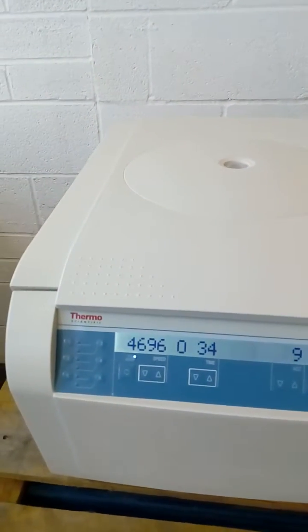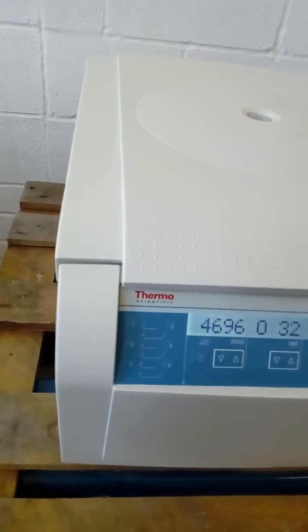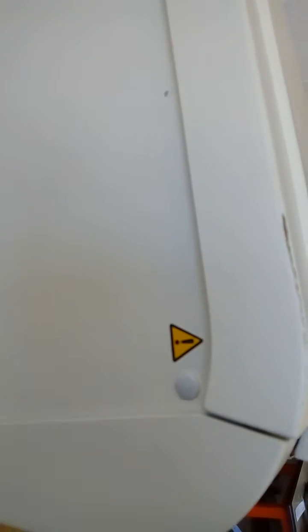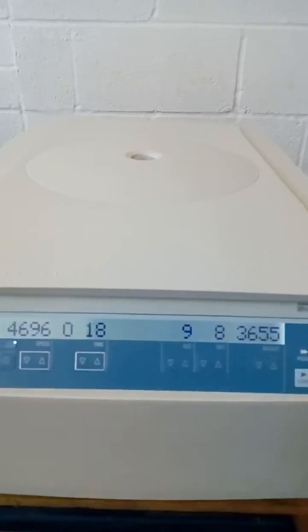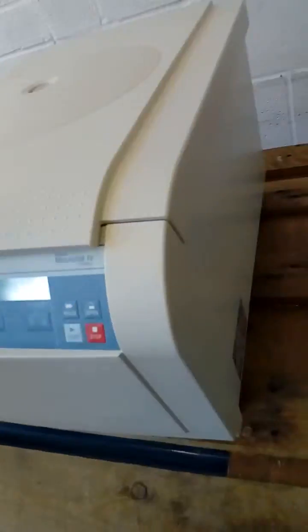The centrifuge is in excellent condition, with just a few minor scratches. As you can see, this does not affect the overall working order of this piece of equipment.